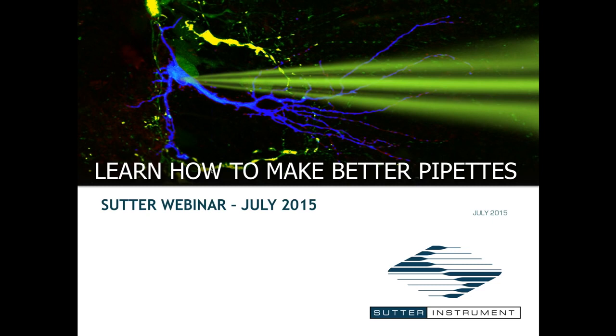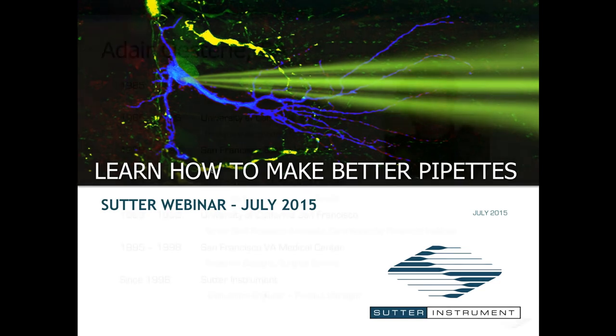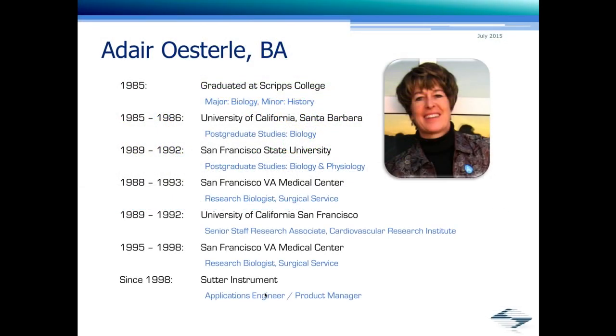Well, here's another one for you, Adair. We experience variability over time, and pipettes pulled later at higher jaw temperatures have naturally smaller tips. We thought that using the safe heat value would help, but in our P1000, it's grayed out and we cannot turn it on. What are we missing?